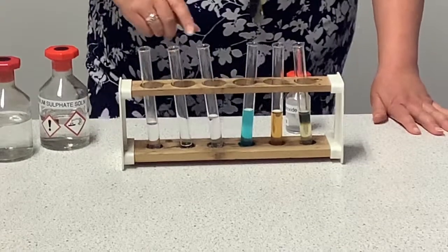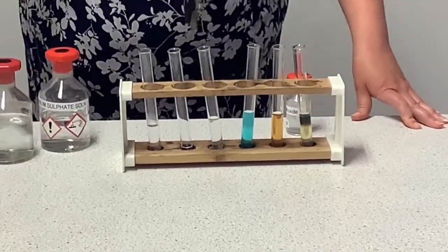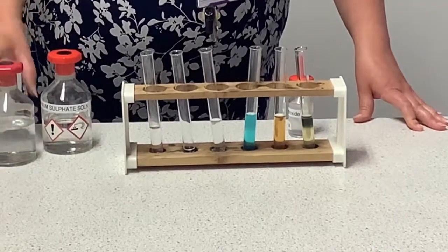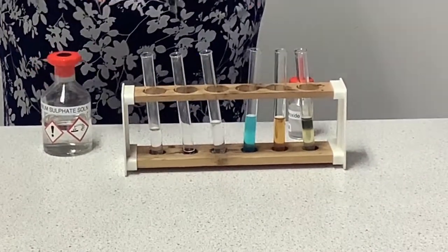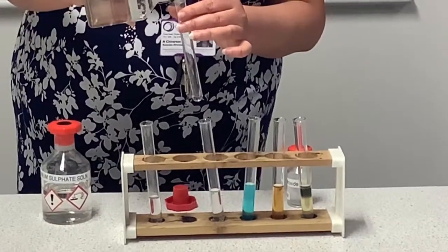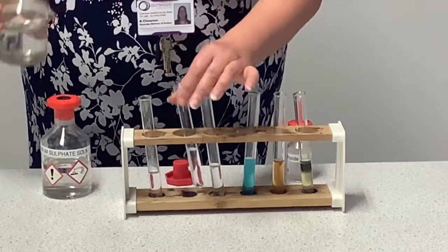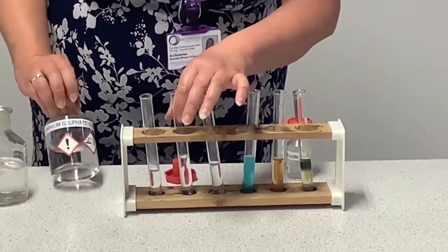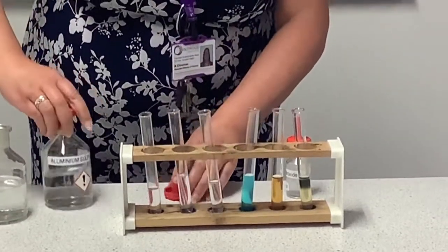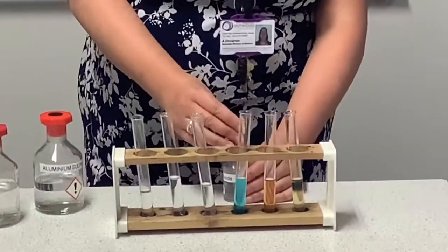Now the next three chemicals I'm going to test are all metals that are colourless solutions. So I have got a magnesium salt, I have got a calcium salt, I'm just going to pour that one in, ready. I just need a small amount, enough to be able to see the precipitate forming. And then finally, I have got an aluminium salt there. So three colourless salts. It's really important that we should be able to identify them.